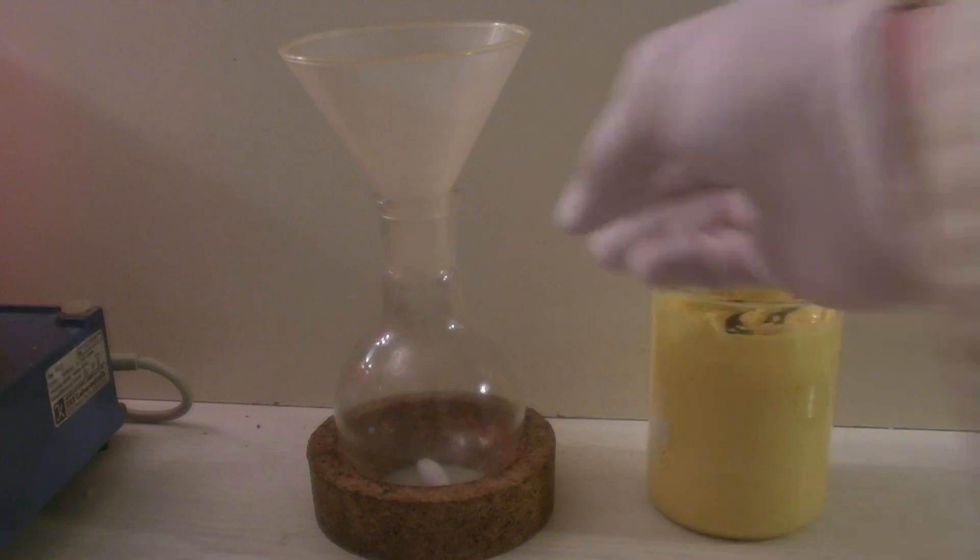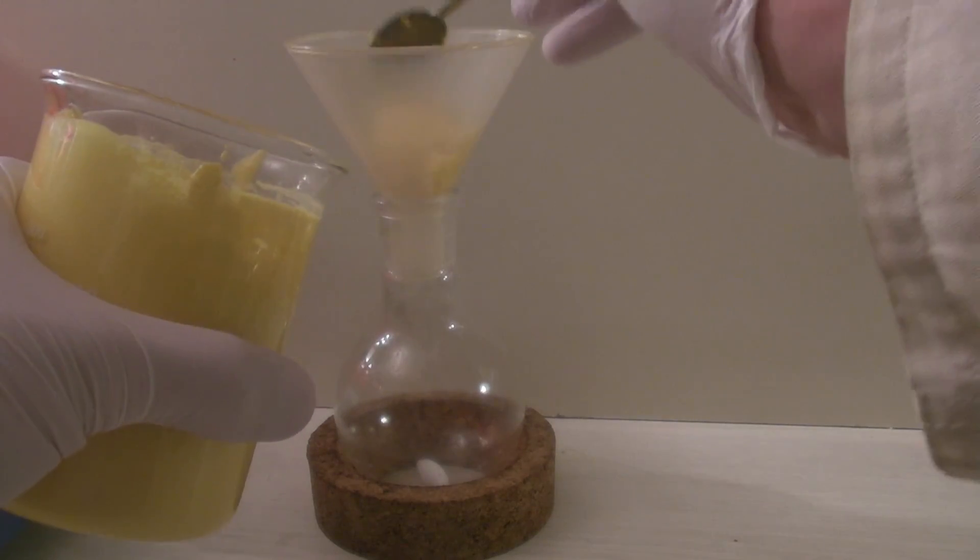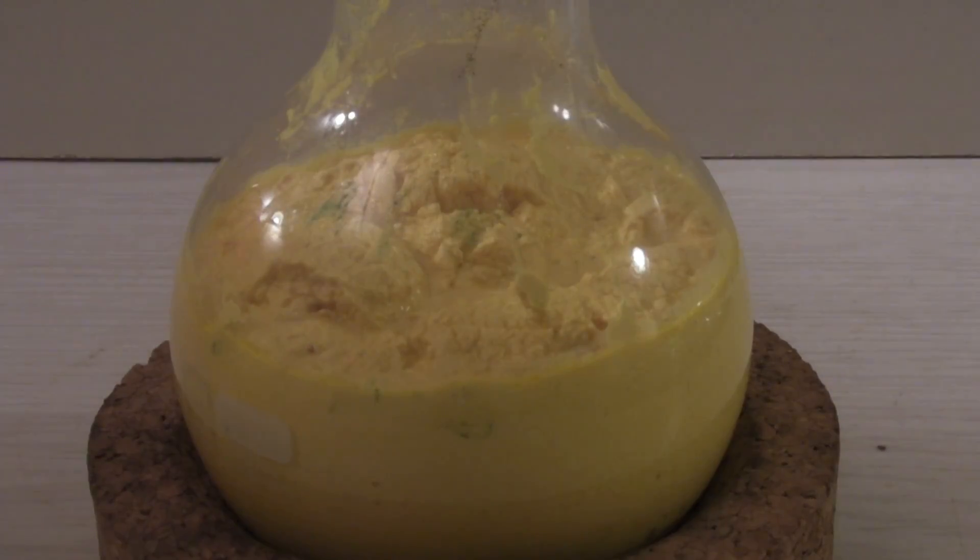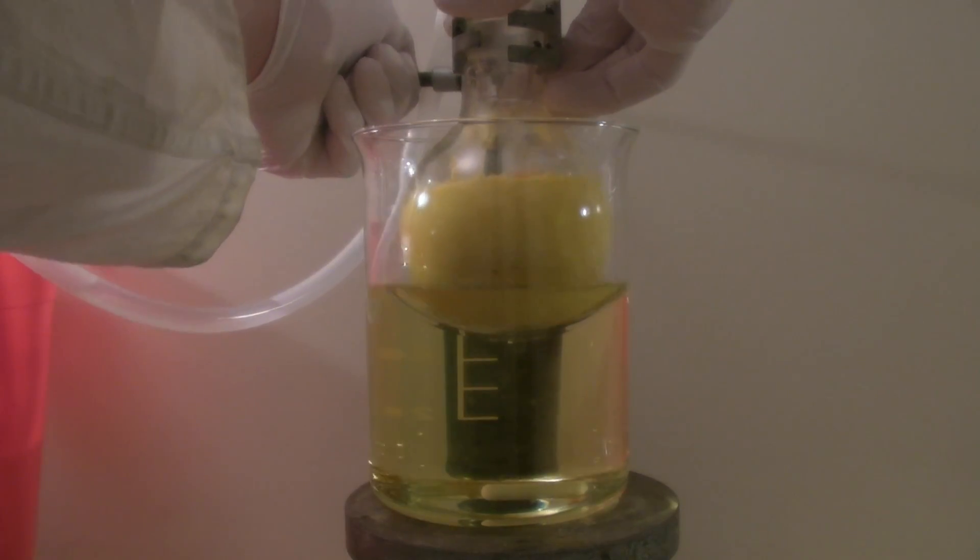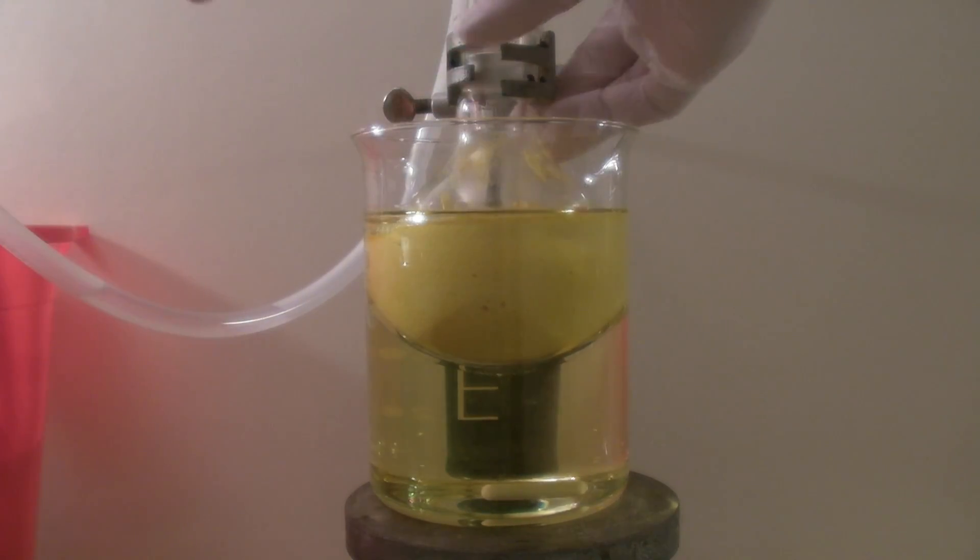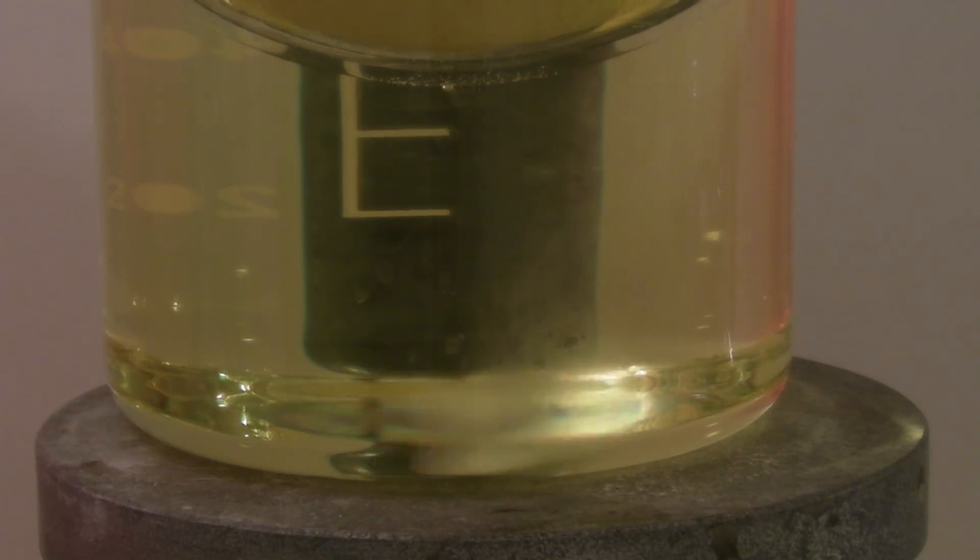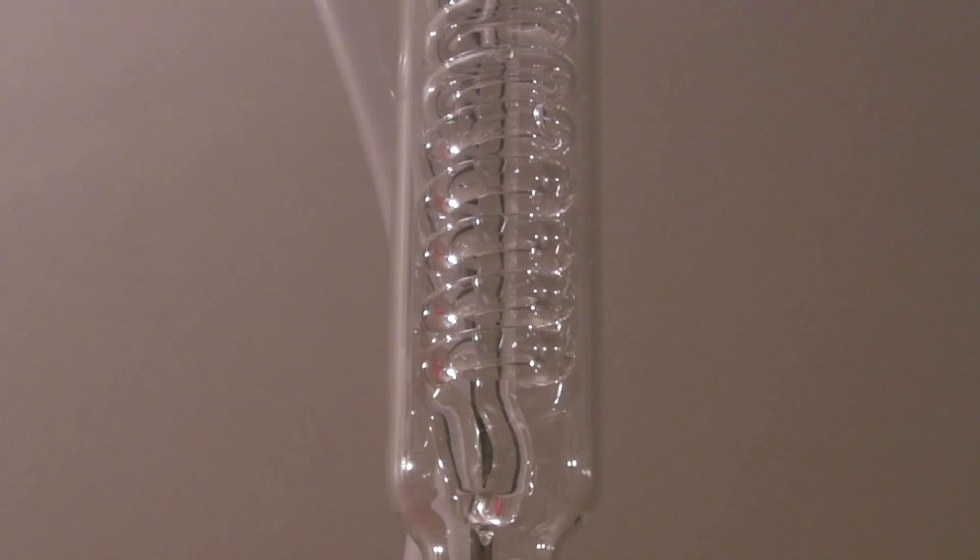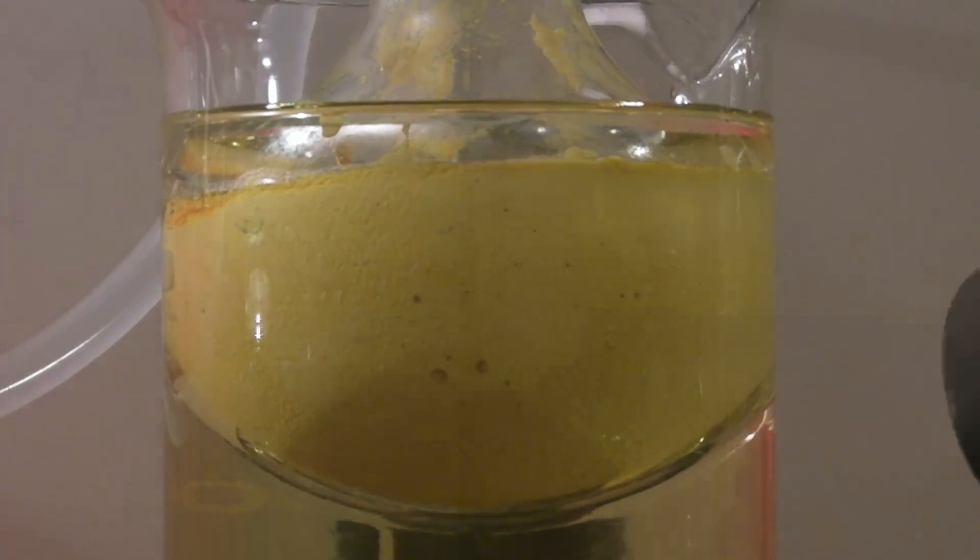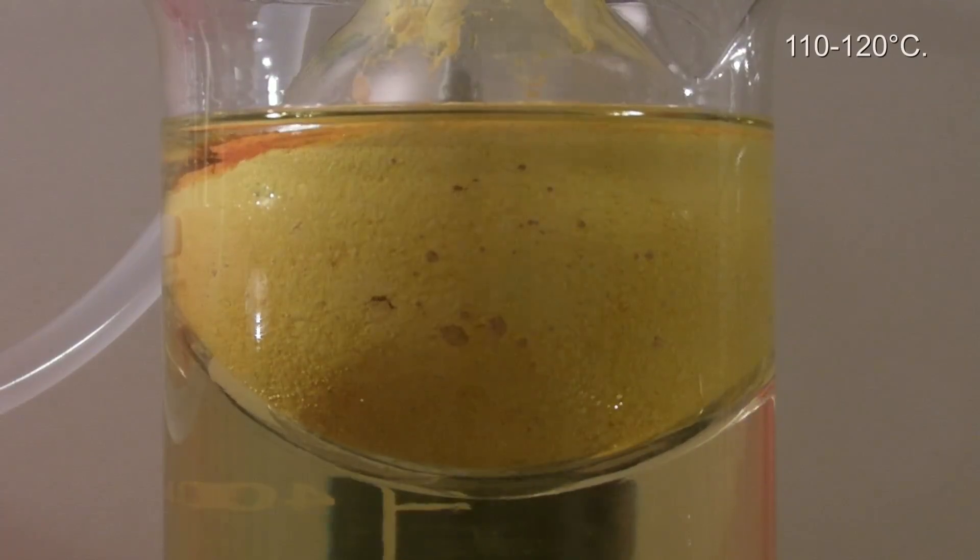Next the mixture is added to a round bottom flask. My largest flask was too small so I had to do this step in two batches. The flask was filled up to two-thirds of its volume, a stirring bar was added and it was connected to a reflux condenser. The oil bath was heated until the water in the mixture began to boil. This happened at a temperature of 110 to 120 degrees C.